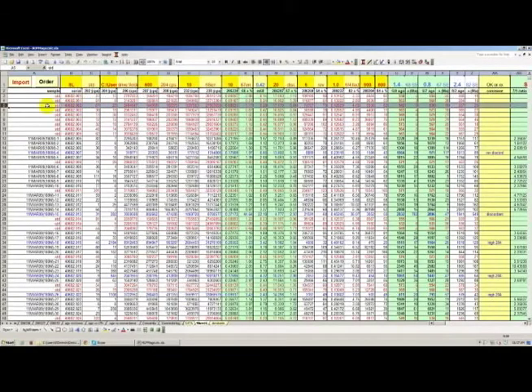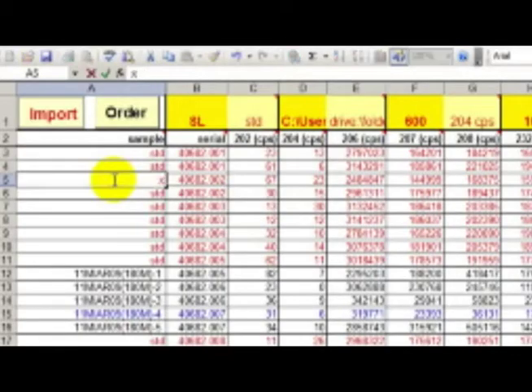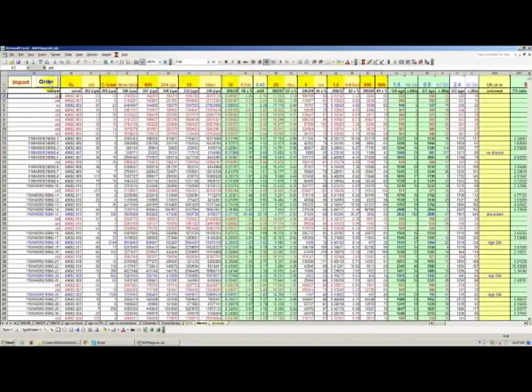So if I want to exclude that from my corrections, you go to the A column where the name of the standard is, and type a lowercase xx label in there. You'll see that when you hit enter, that line is going to turn blue. Lines that are blue are problematic in some regard, which we'll cover a little bit later in this video.